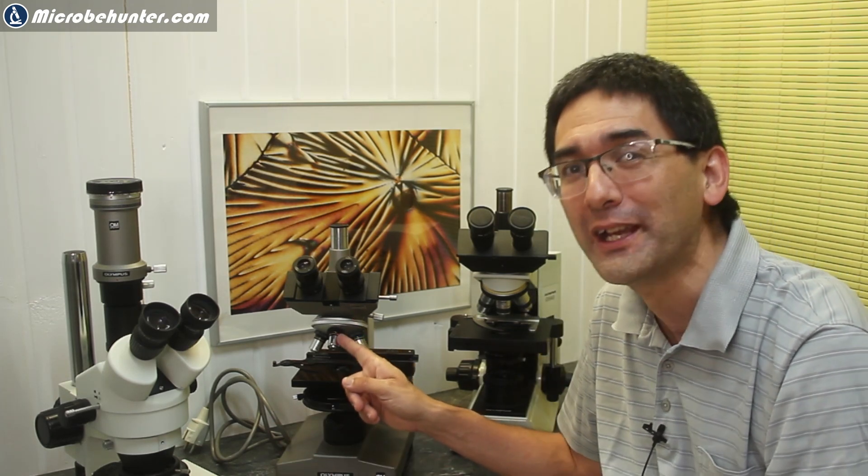Hi, MicrobeHunter here, and today I would like to answer another one of my viewers' questions. It's a slightly technical question, and it relates to the exchanging of objectives on microscopes. Because the question might be a little bit difficult to understand, please bear with me. I would like to explain it first before I actually answer the question.